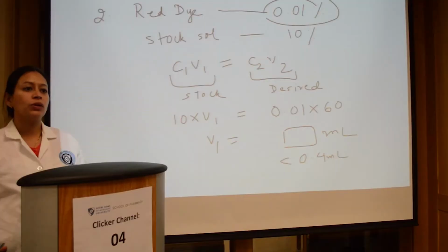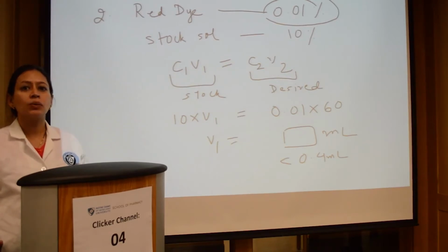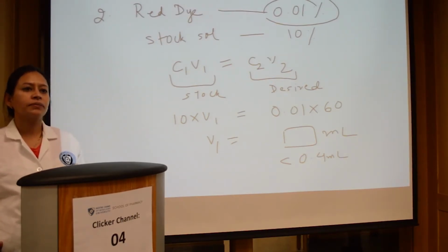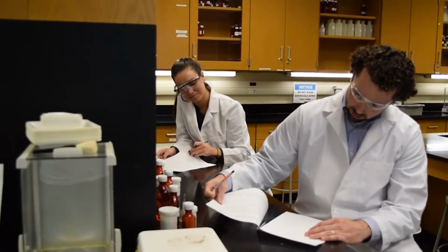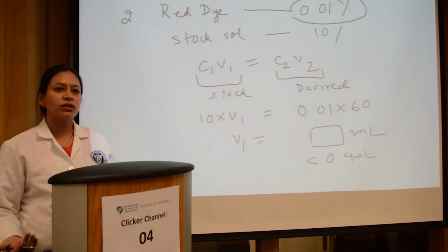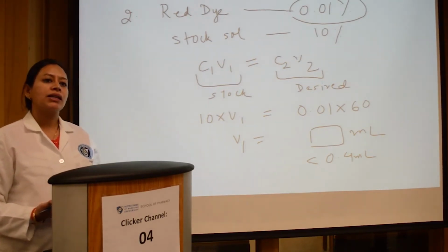Similarly, you will just do the calculations for the rest of the ingredients that you have in your prescription. Okay, so you have sucrose, because obviously sucrose is required for providing the sweetness. Okay, and the dye gives you the color. Okay, what is the flavoring agent in this preparation? Vanillin, right? So vanillin is the flavor, and then do you have anything else in the preparation? Water. So water is used as the vehicle because it's an aqueous preparation, so you need water to dissolve the sucrose, right?